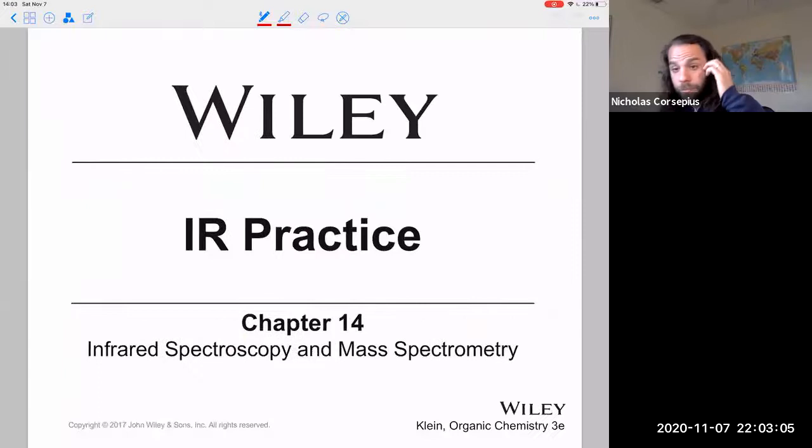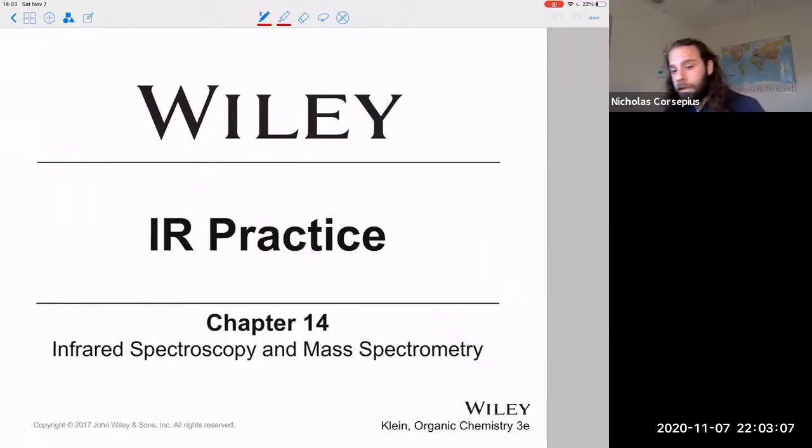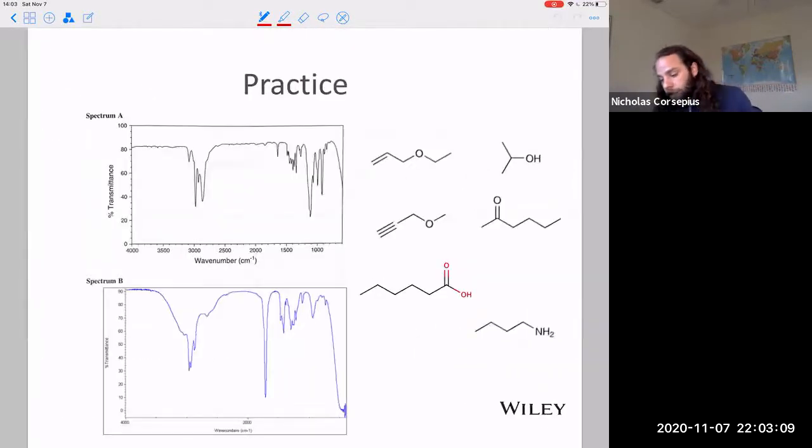Okay, so then let's just do some practice here. All right. So I'm given spectra here, and then I'm going to have to identify which one of these unknowns it corresponds to. One of the first things that I would do is actually look at my list of unknowns.